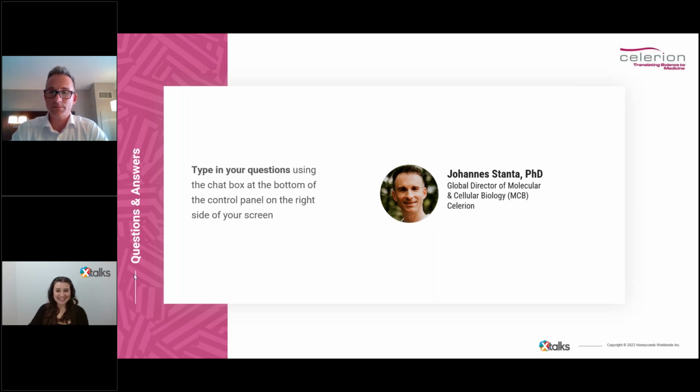Thank you for that answer. Another audience member would like to know, what would be the reason for a shedding result to revert back to a positive result after a 2 times negative?